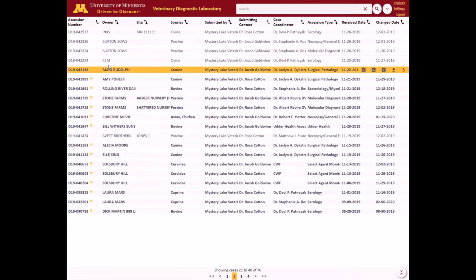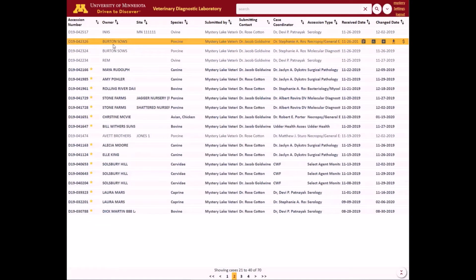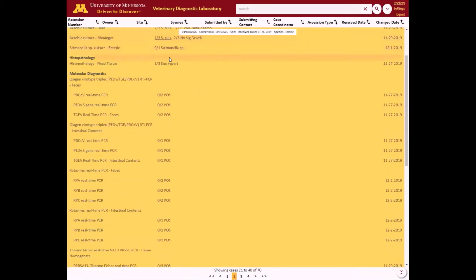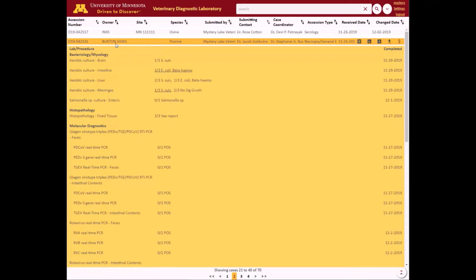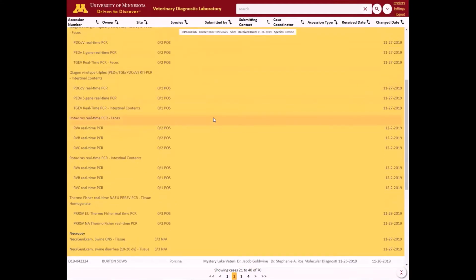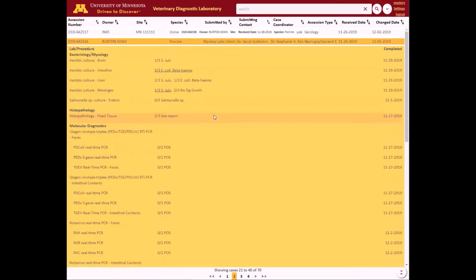So as we look through, we'll look at an example here. As I had mentioned, if you click the case header row, it'll open your case summary up. If you scroll beyond the point at which you can see the demographic information, that is when the floating field will come up. And so we can see the case number and whatever fields you selected as showing up on your floating fields, so that you have a frame of reference for whatever information you might be looking at on a case that's longer.